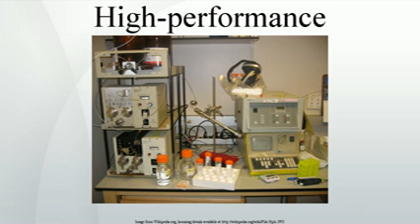early in the analysis. An investigator can increase retention times by adding more water to the mobile phase, thereby making the affinity of the hydrophobic analyte for the hydrophobic stationary phase stronger relative to the now more hydrophilic mobile phase. Similarly, an investigator can decrease retention time by adding more organic solvent to the eluent. RP-HPLC is so commonly used that it is often incorrectly referred to as HPLC without further specification. The pharmaceutical industry regularly employs RP-HPLC to qualify drugs before their release.